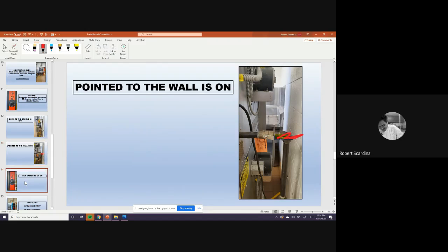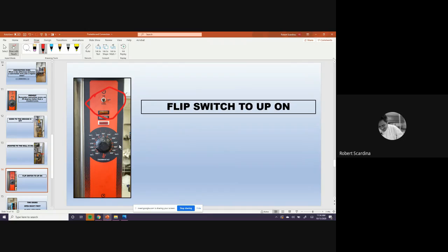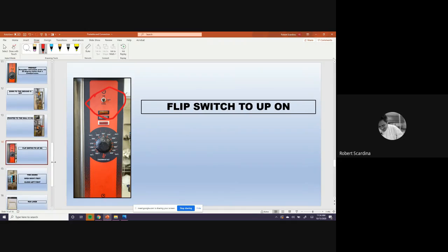Now, after the gas is on, all you have to do is flip this switch right here to on, set the temperature you want, and you're pretty much ready to go. But you do need to know this.